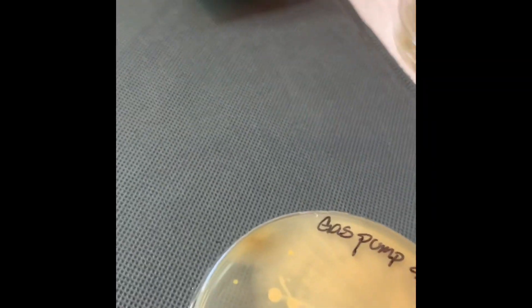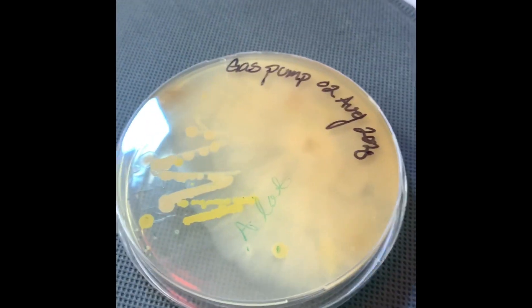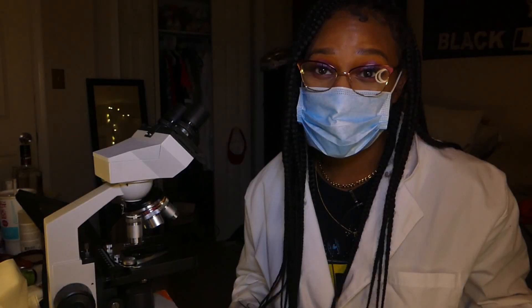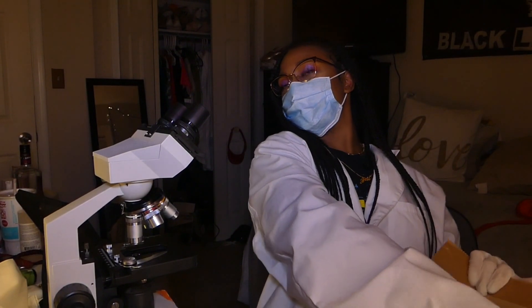I'm just going to put 'a lot' for the gas pump colony count. When you're touching that gas pump handle, that is what you are touching.